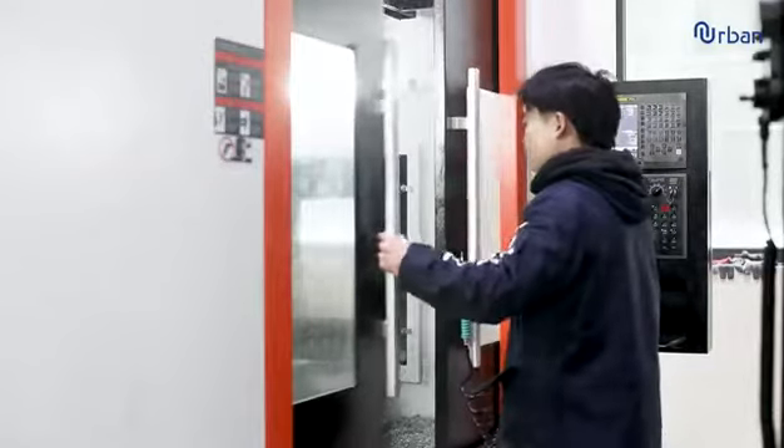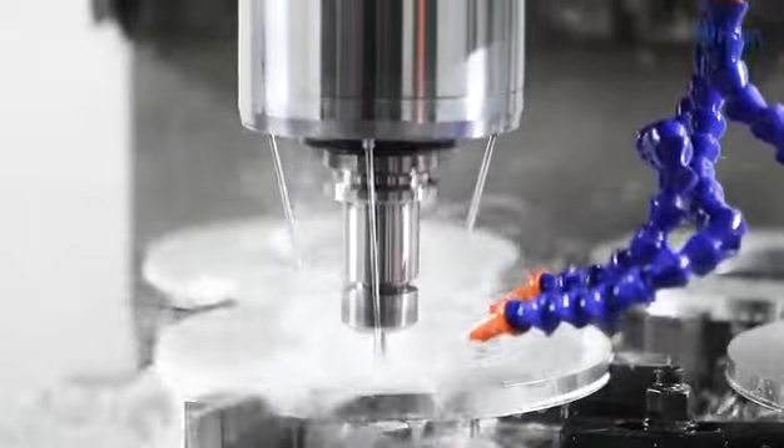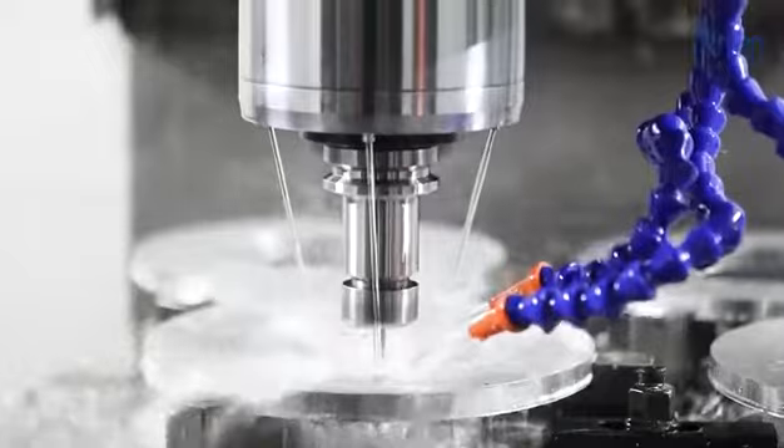We will also provide detailed loading and unloading videos after you purchase the machine and provide you with technical support online.